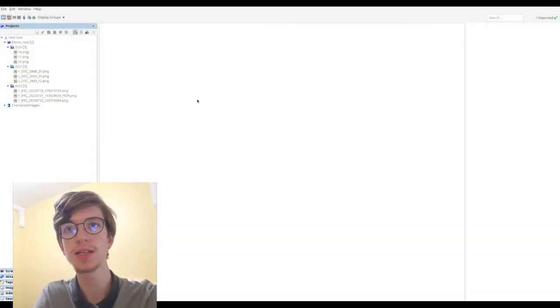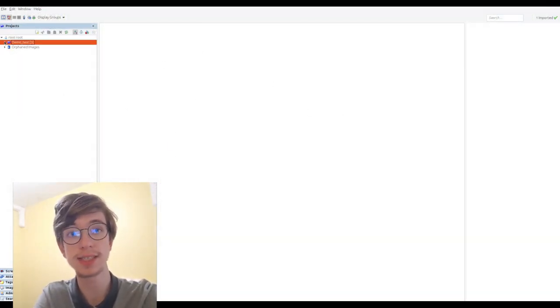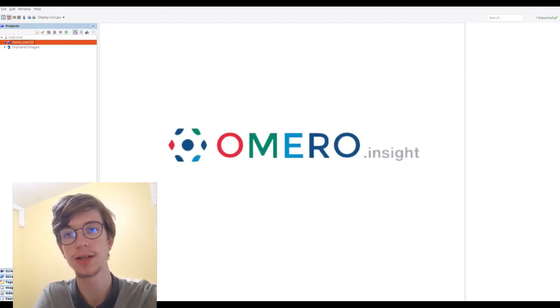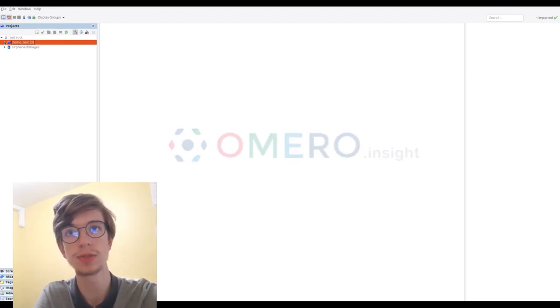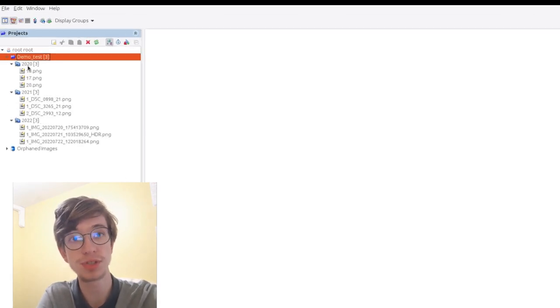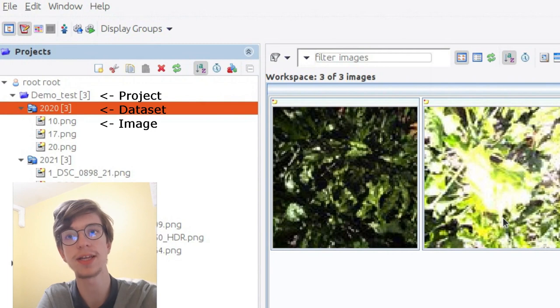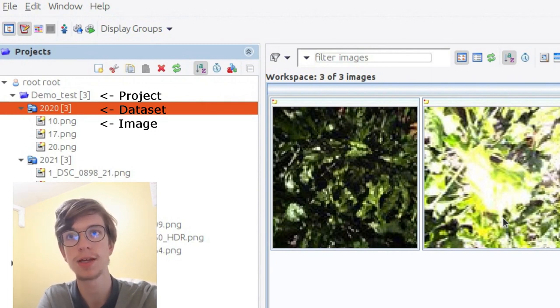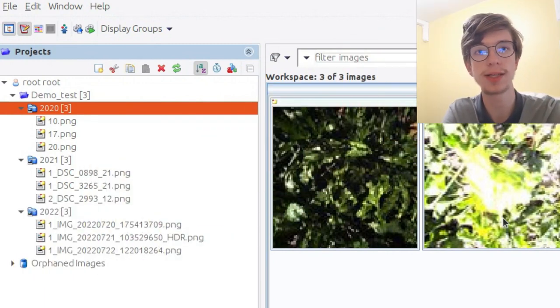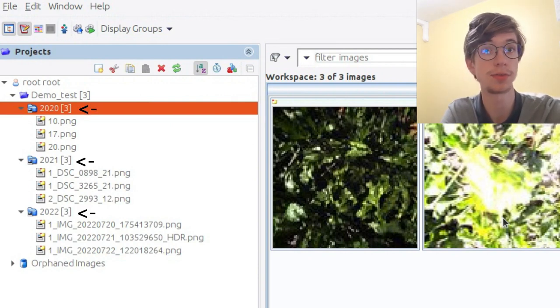So this is how Homero looks like. It's Homero Insight, which is the application you can install using Homero. On the left, you can find some projects, datasets, and images. Images are in datasets, and datasets are in projects. In this quick example, we've got one project with three datasets corresponding to each year.